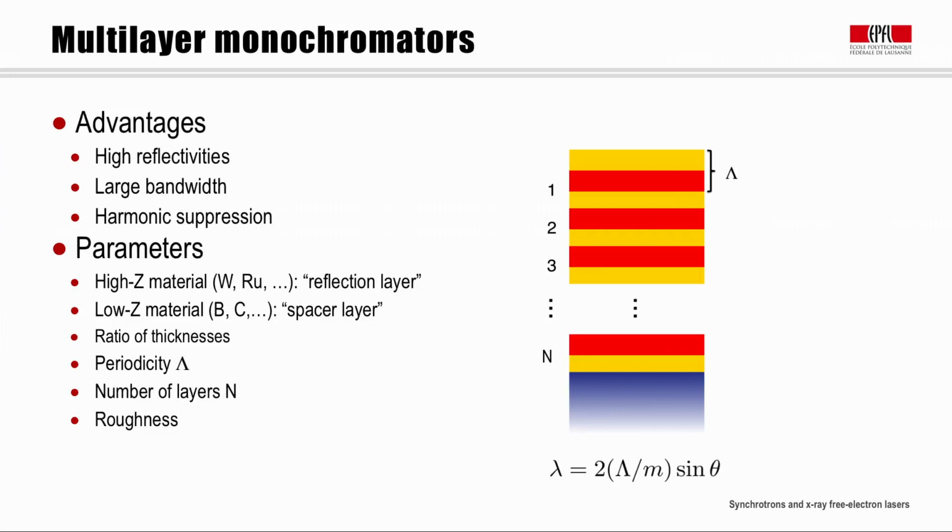Techniques such as X-ray computed tomography profit from this, as in few cases does a narrow bandwidth bring advantages, while rapid data acquisition can access morphological changes on the sub-second or even the few millisecond timescale. Lastly, we will also see that the larger periodicity of multilayers compared to crystals, by an order of magnitude, can lead to refraction effects that can be exploited in suppressing harmonic contamination.